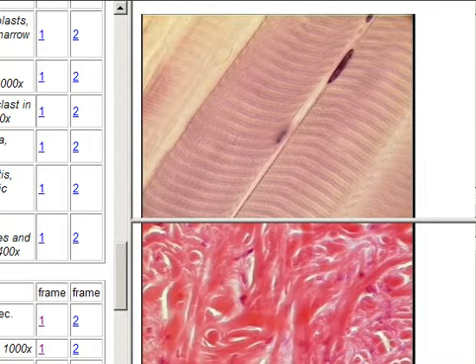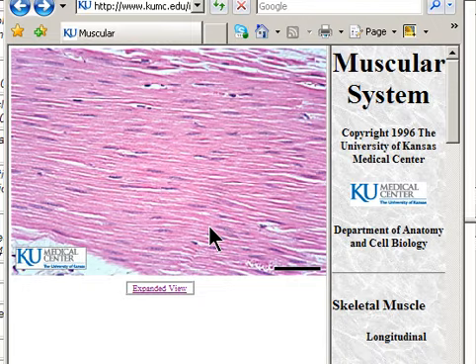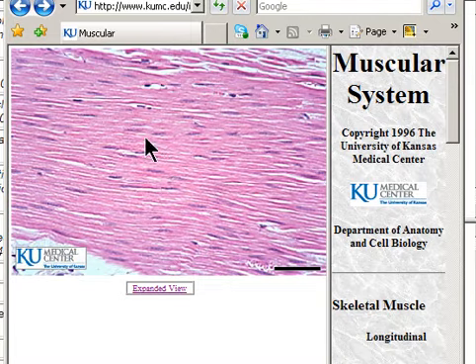And again, to show you another picture of smooth muscle. So here we have smooth muscle from another site that you were required to look at. So look at this. You can see these spindle-shaped cells with these nuclei. It kind of looks like fish swimming in a stream. So that's one way I look at it for you to identify. So you can see how this looks very similar to the image you have, but it's very different from dense connective tissue.